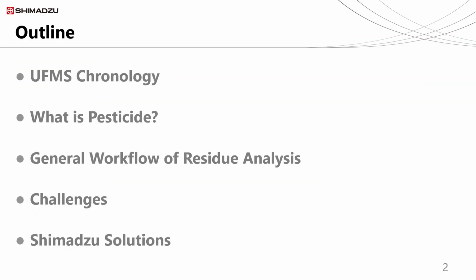In today's webinar, we'll discuss how Shimadzu's UFMS technology evolved over the past decade. Before we go and discuss pesticide analysis, we'll discuss what a pest is and what a pesticide is. Then we'll discuss the general workflow for multi-residue analysis. Then we'll also discuss the common challenges faced by testing laboratories, followed by Shimadzu's UFMS solution to overcome those analytical challenges.